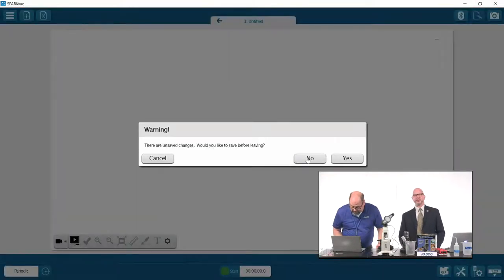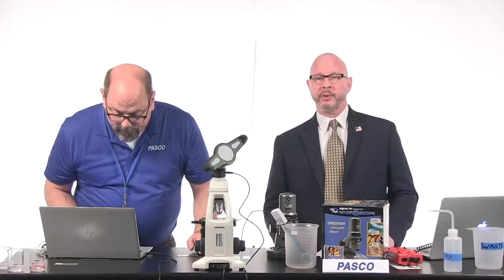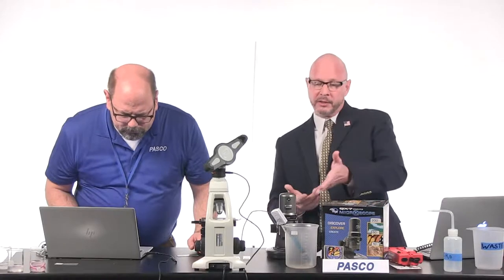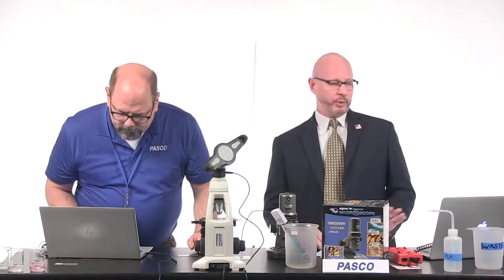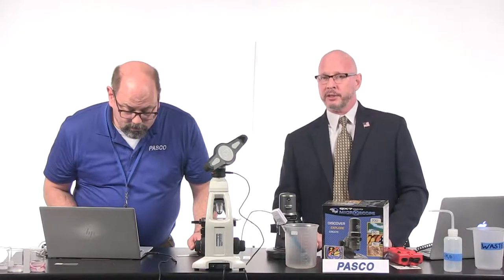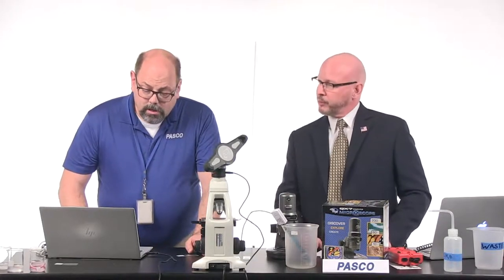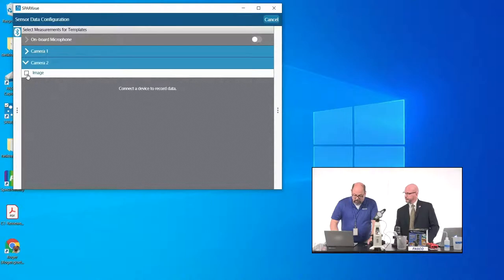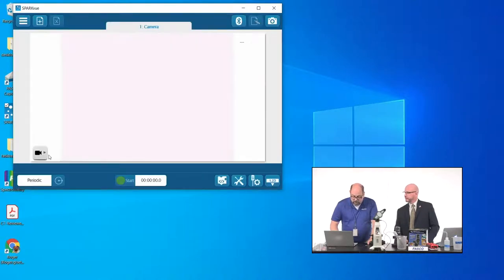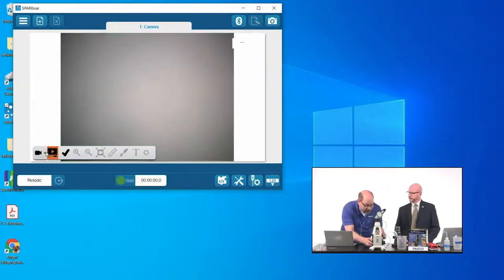I know. Right, so your computer has the capability of capturing two cameras, actually. In this case, your computer camera can capture any images of you or of you holding up something like, in this case, maybe a pH sensor. You can capture that picture and integrate that into your lab, or you can connect it to another digital camera. In this case, we can connect it to the digital camera of the microscope and capture that image. And so you see, I'm choosing which of the two cameras. One was the camera on the computer itself. I've now switched to hook up to the microscope so that we can see those. And let me turn that on so we can see what's going on. There we go.